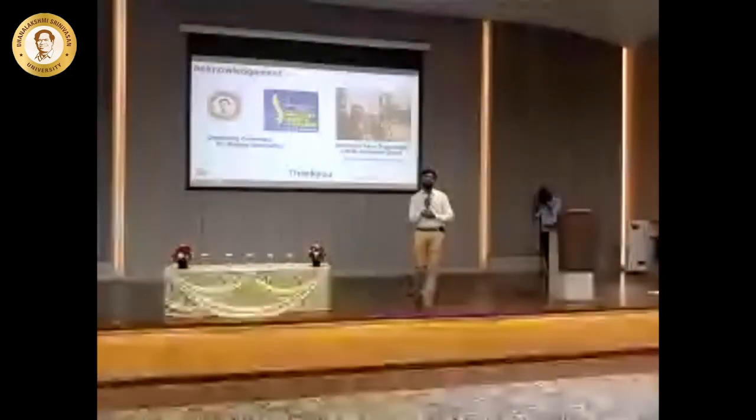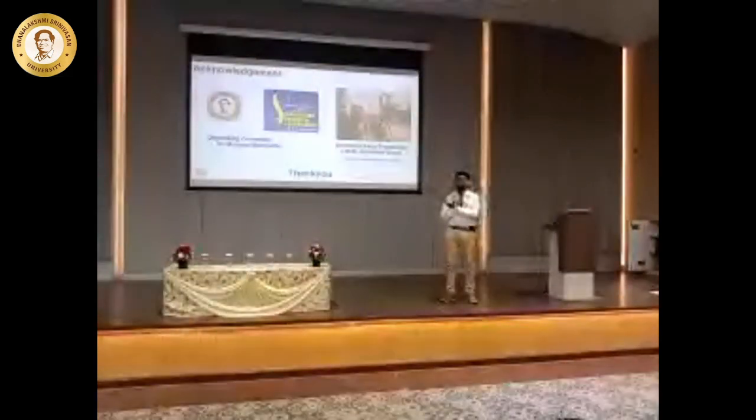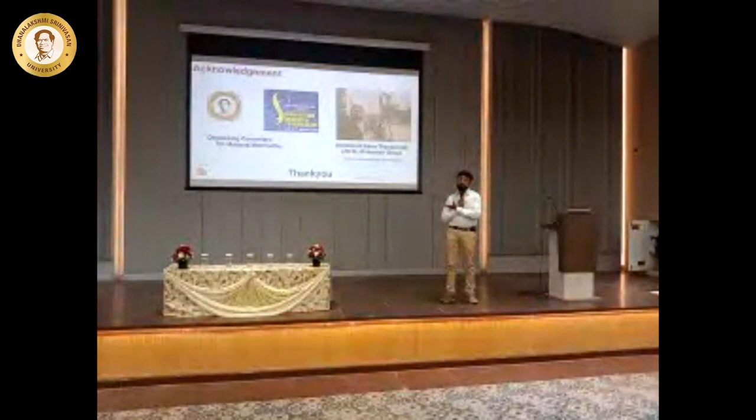Okay, so from the synthesis side there is no difference. On the synthesis side, the difference is that you can even do surface functionalization within the droplets. That is also possible, and a lot of people have worked on that as well. And definitely you can tune it. Okay, yes, thank you.